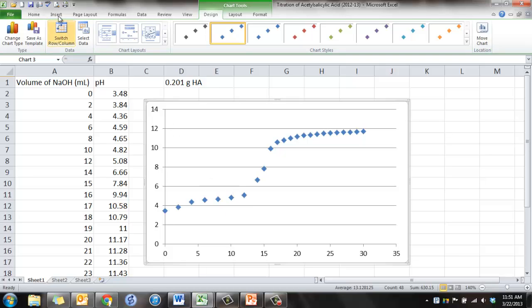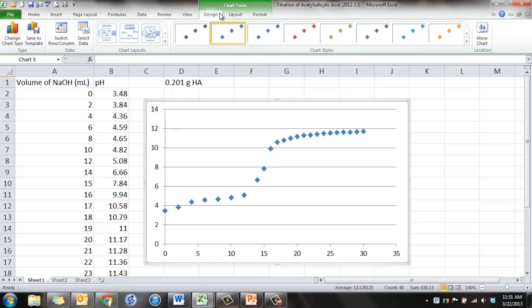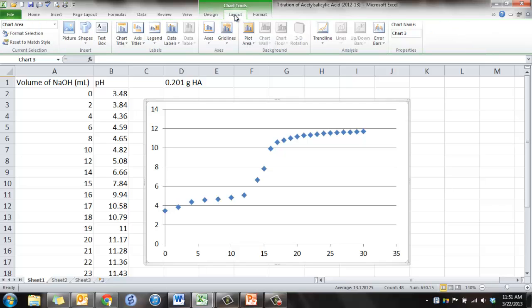Alright, so let's put our title on this. We're going to click on your graph overall. See these options up here for chart tools? You have Design, Layout, and Format. We're going to click on the Layout, and we're going to click on Chart Title.